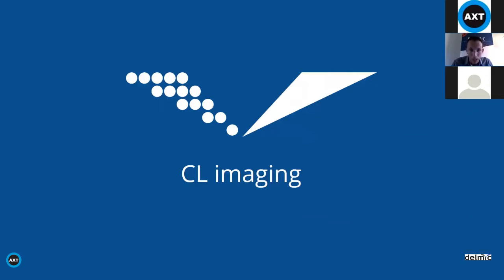All right, let's see if there are any other questions. Yes. Another question is whether, if you do quantification, a standard reference material is required. I guess that could be useful, but the reference material should be very similar to the rock you're looking at, and so a problematic thing would be that you would need a lot of reference materials in order to properly quantify your samples.